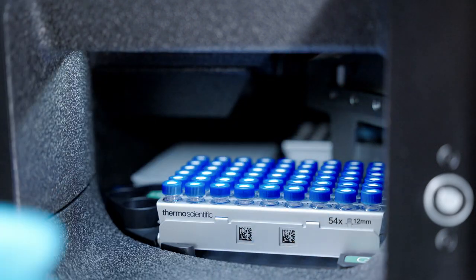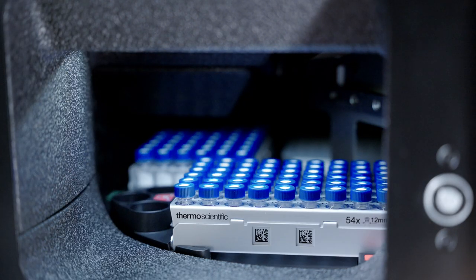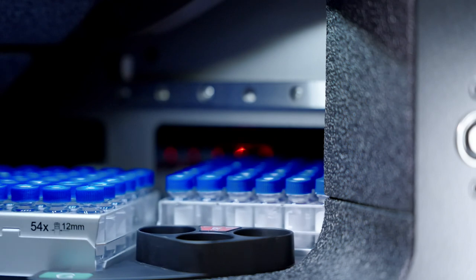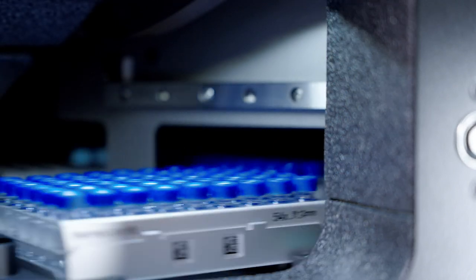An automated barcode reader manages inventory by keeping track of rack position, orientation, and sample type so you don't have to.